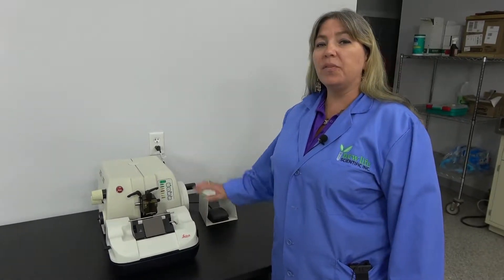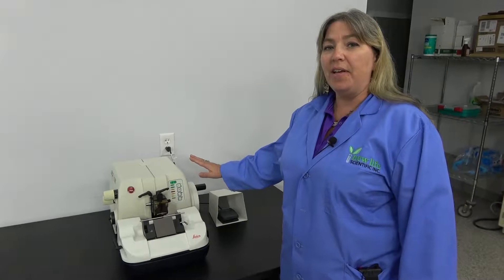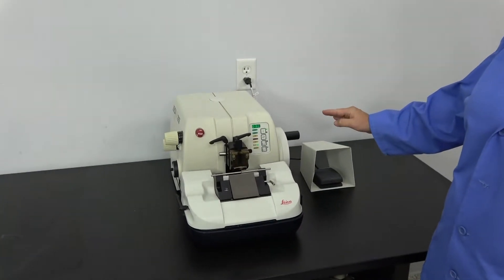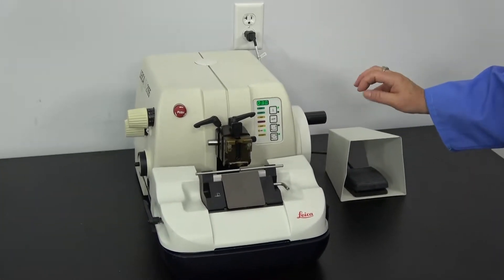Hi, I'm Lori and today at New Life Scientific we're going to take a look at the Leica RM2155. This is a microtome which many of you are probably familiar with. We're just going to run through some of the placements of the settings.